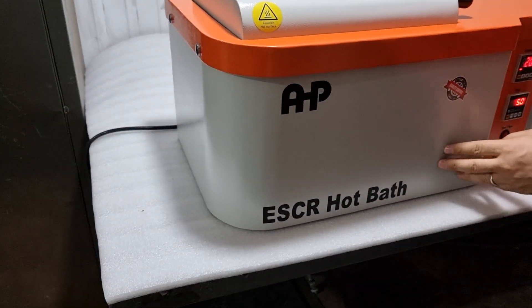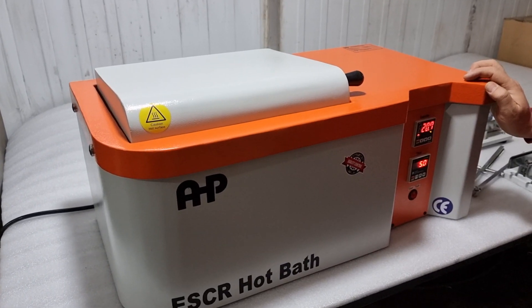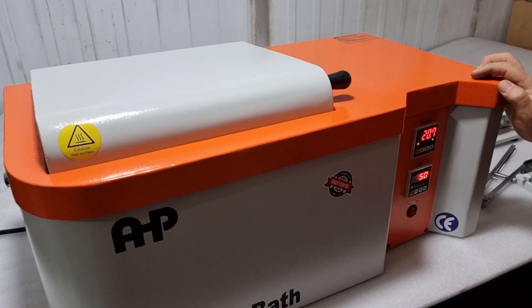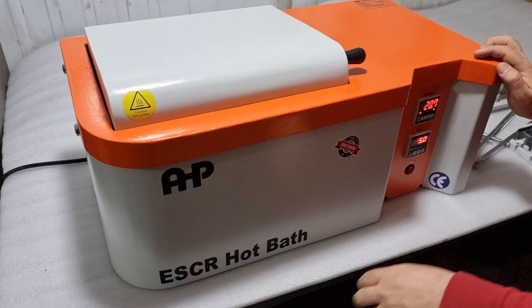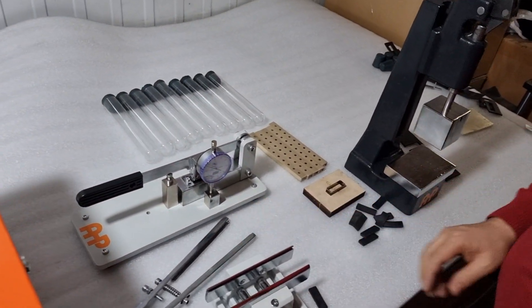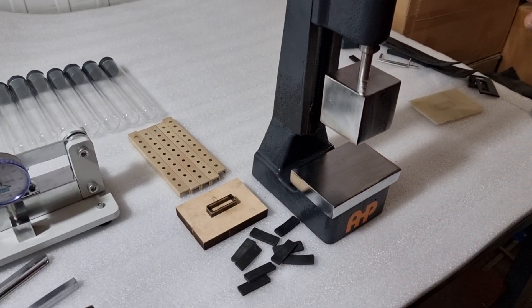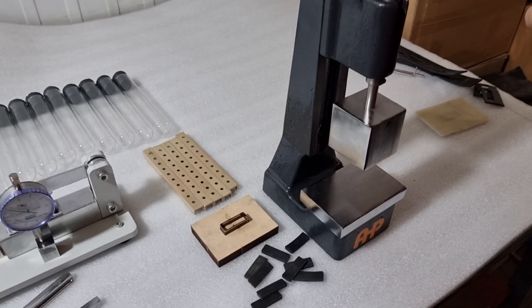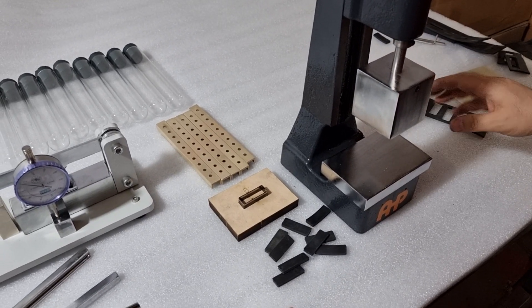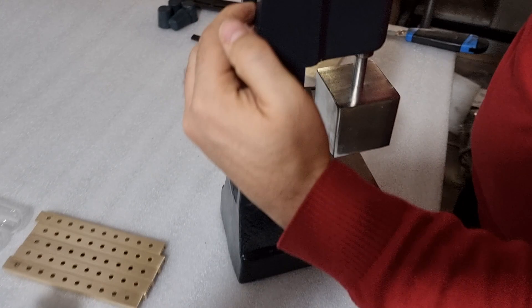ESCR hot bath test according to ASTM D1693 — Environmental Stress Cracking Resistance of polymer materials. First of all, you need to prepare a sample sheet with the thickness as per the ASTM standard. Then we need to adjust the press tool: the height of the head of the press tool needs to be adjusted.